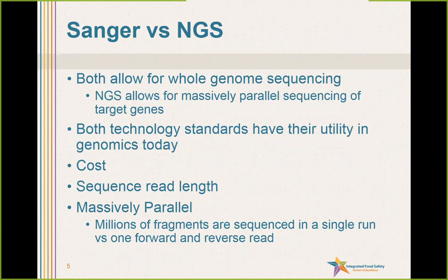There are several considerations when deciding with which platform to sequence. All technologies can do the job, but there is a balance based on a variety of factors. Cost is a factor when you start looking at switching platforms. Because Sanger has been well adopted, there is less startup cost than if you start incorporating a new technology. With Sanger sequencing, you can sequence a small amount, but the quality is much higher.